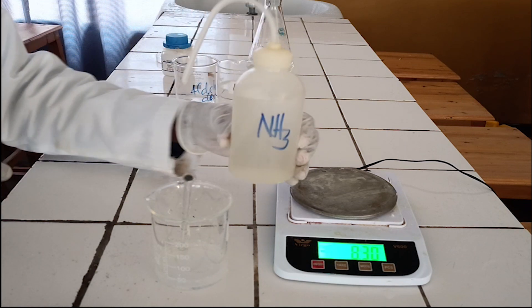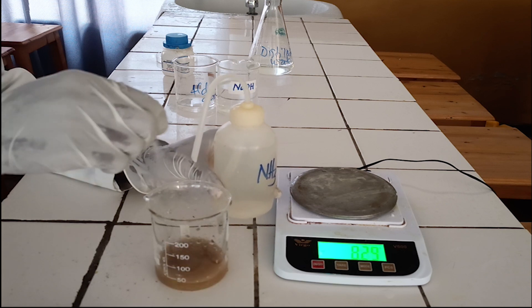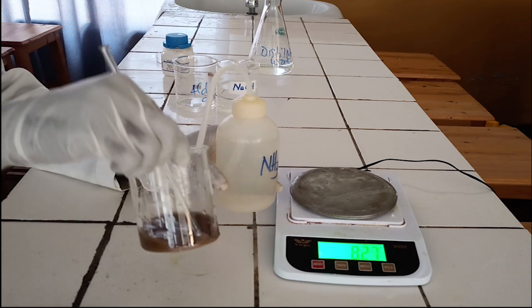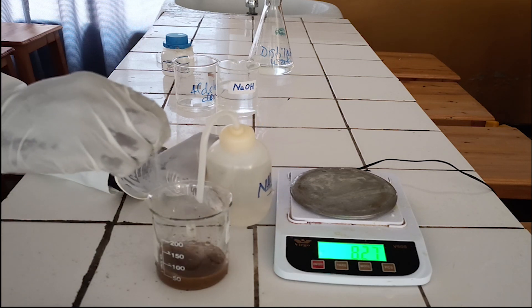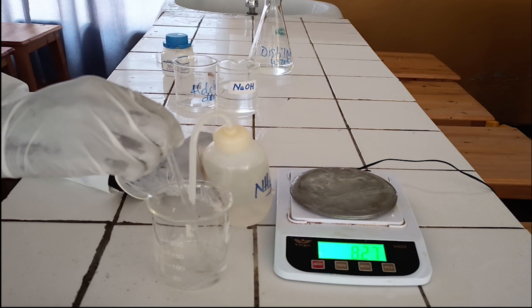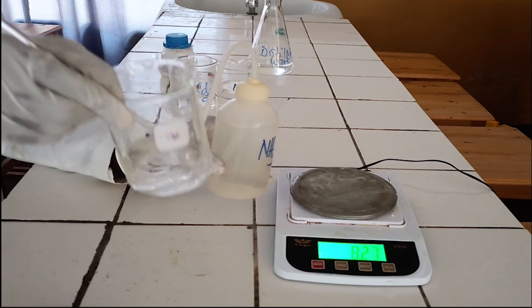To the solution of silver nitrate, add ammonia dropwise. As you see, silver nitrate reacts with ammonia to form a precipitate, which dissolves in excess of ammonia. This solution we made is Tollens Reagent. Tollens Reagent contains the diamine silver(I) ion.